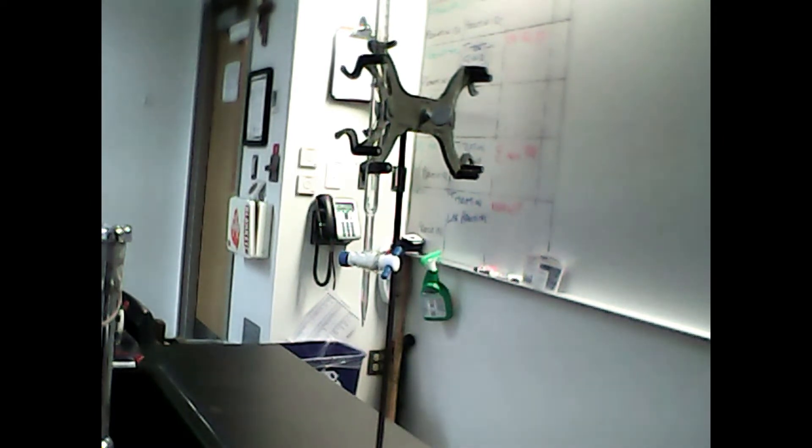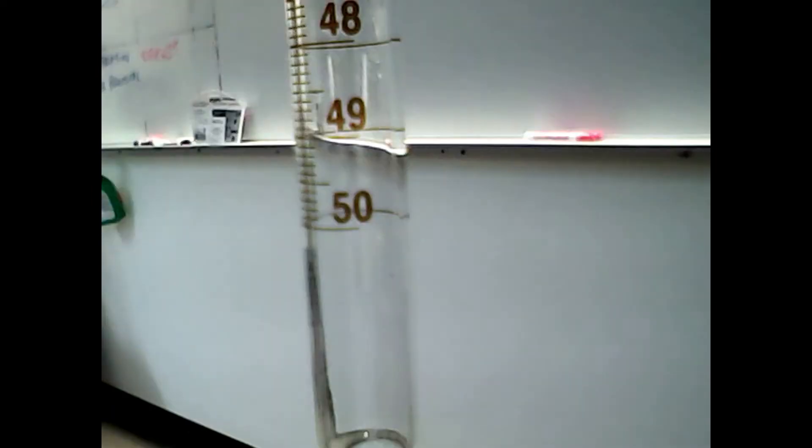It has some interesting markings on the side. We'll take a closer look. It is marked 50 milliliters, which tells us that the measurable volume that a burette can accurately tell us is anywhere between 0 and 50 milliliters.